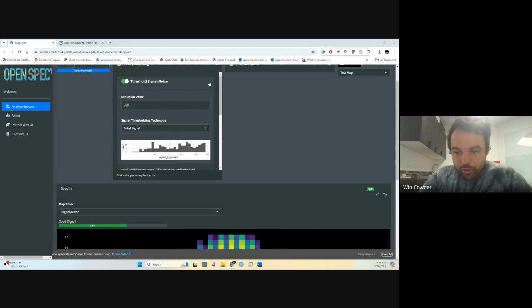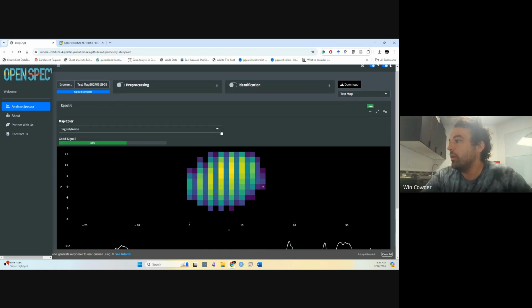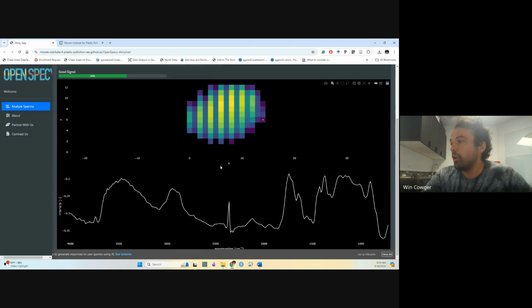What does good signal mean? That's a very good question. Good signal is one of those things that is a little bit of an art to define. One of the things you could use to define good signal is your signal to noise ratio.